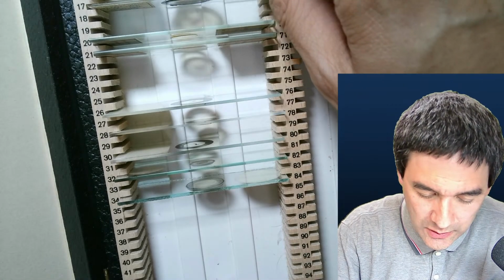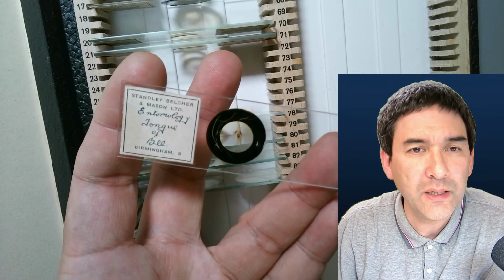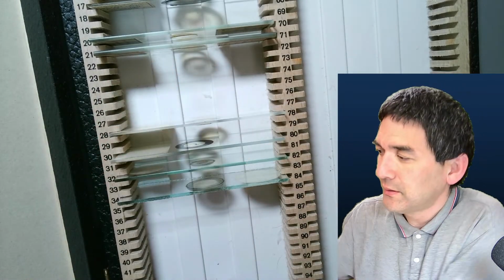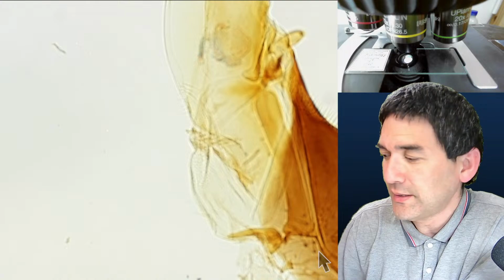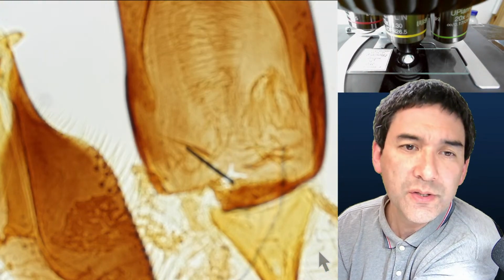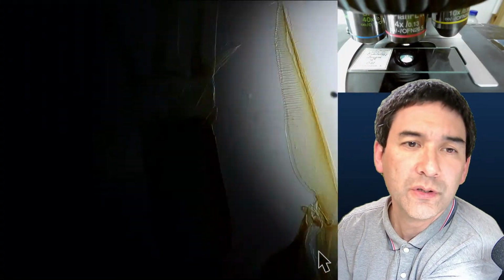And the next one is, what is this here? The tongue of a bee. And I think for that one I did make again a stitched image. So let's put it back into the microscope. Scope view, here we go again. Always refocus a bit. Let's go down with the magnification further.